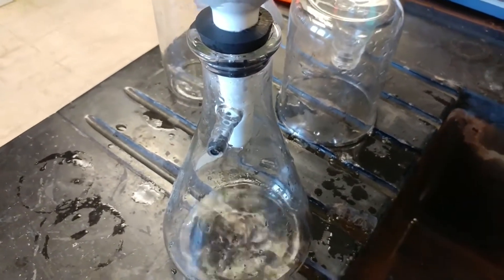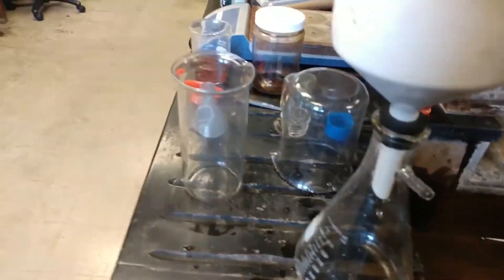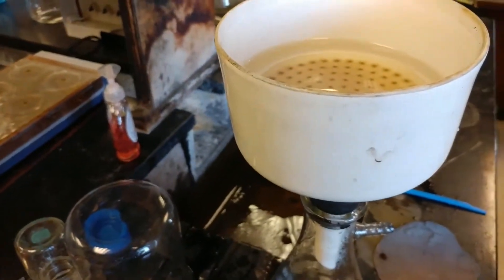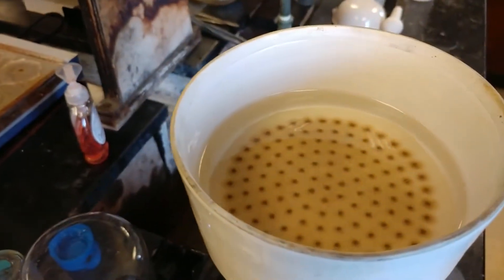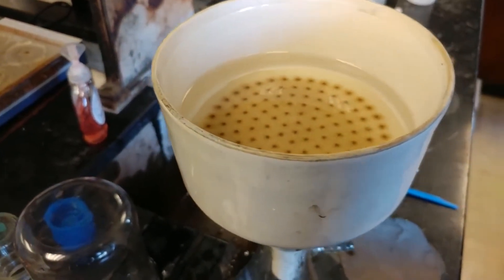Remember those reverse osmosis membranes? They pass through multiple, multiple, multiple times to get all their stuff out. So we're getting a little bit here. Maybe it's interesting, maybe it's not.